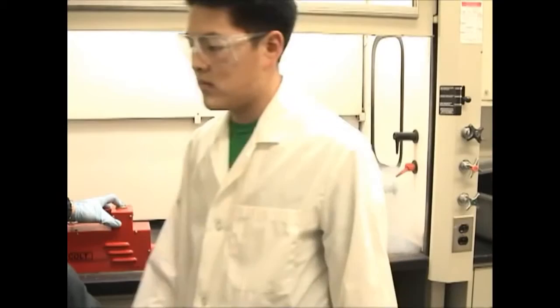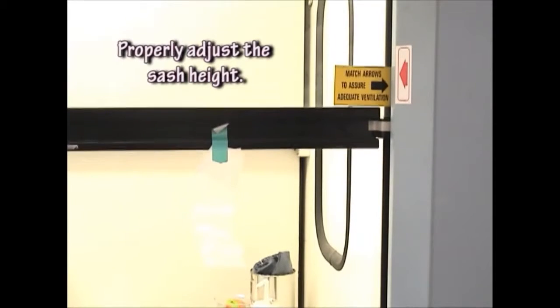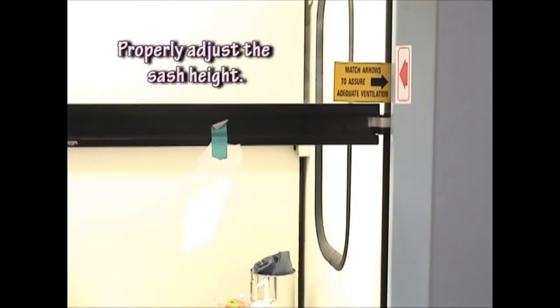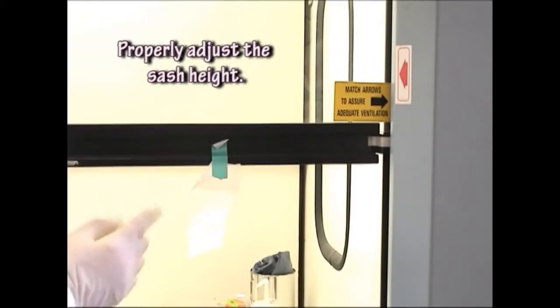In this case, the sash is too high and when someone walks by, the low inflow velocity allows the smoke to come out of the fume hood. Adjust the sash to the proper height. Here, the glass sash was raised to the maximum working height as indicated by the joined arrows, then slightly lowered. The tissue on the sash is drawn in, indicating that there is airflow into the hood.